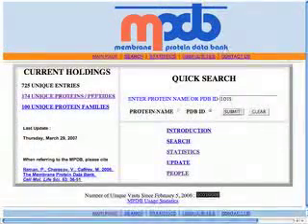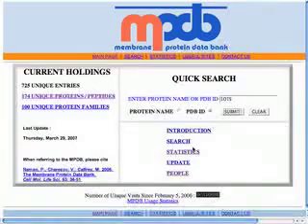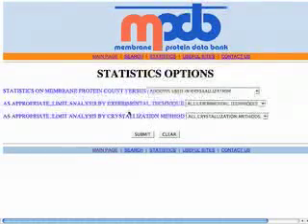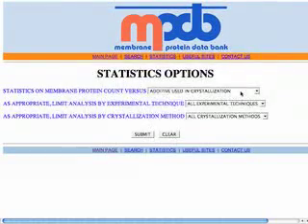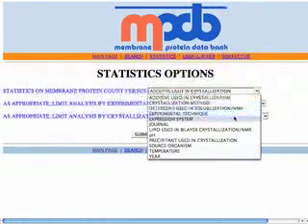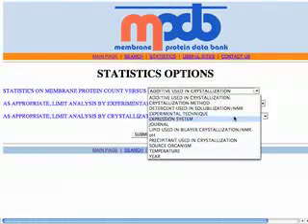The great power of the MPDB is in the compiled statistics for all membrane proteins. Here you can see that we have statistics on every parameter used in these experiments, ranging from crystallization method to detergent to expression system, lipid use, and so on and so forth.